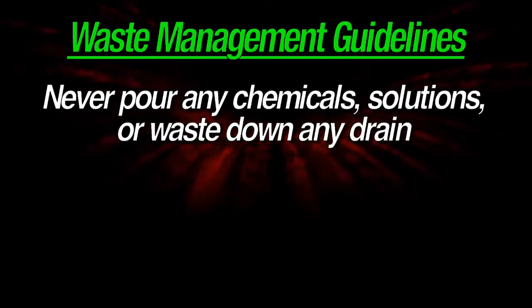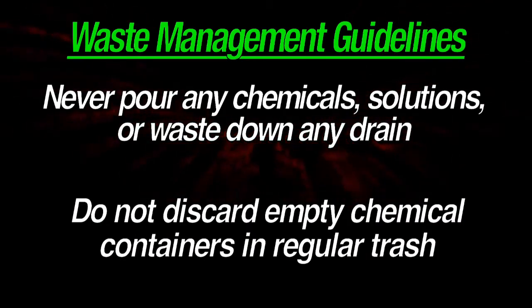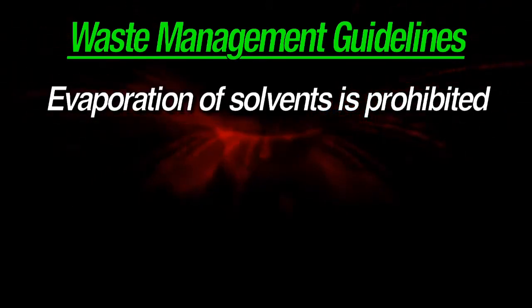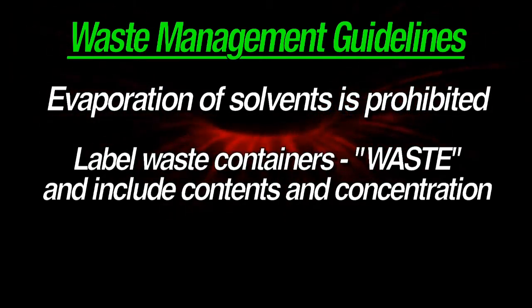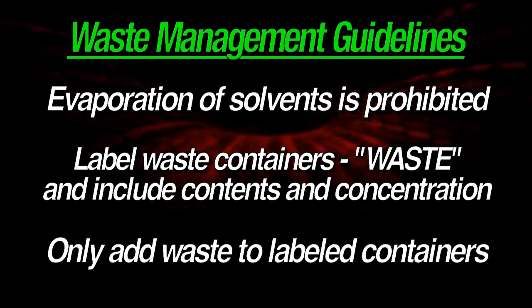Never pour any chemicals, solutions, or waste down any drain. Do not discard empty chemical containers in regular trash. Evaporation of solvents is prohibited. Label all waste containers with the word waste and contents, including concentration, to prevent unknowns. Add waste only to the appropriate labeled container.